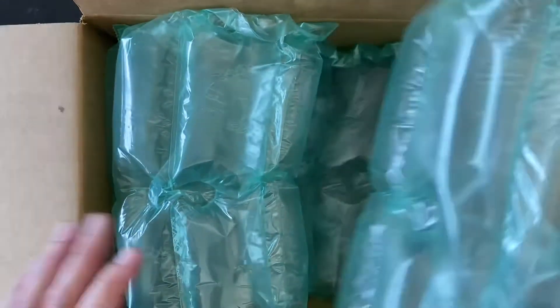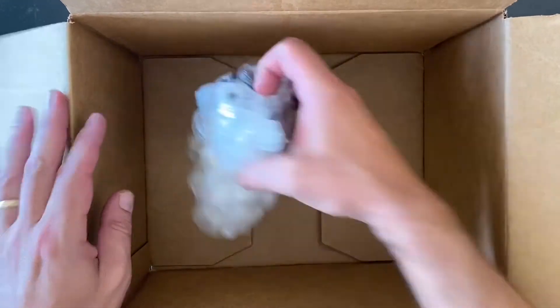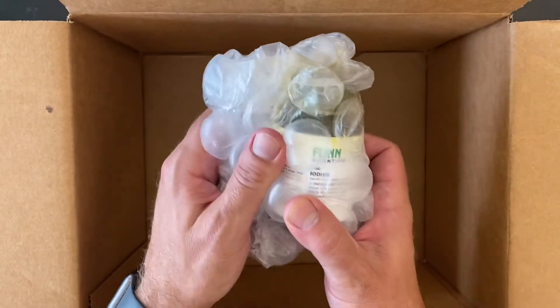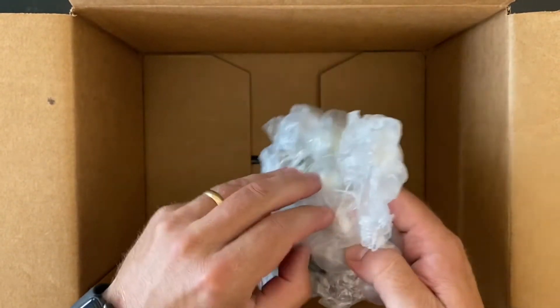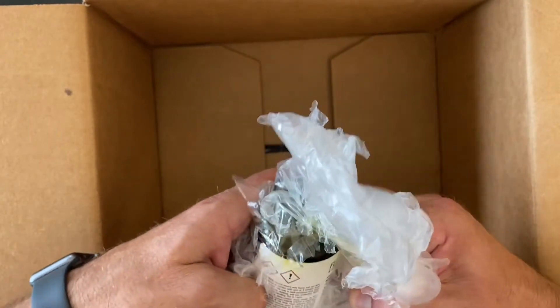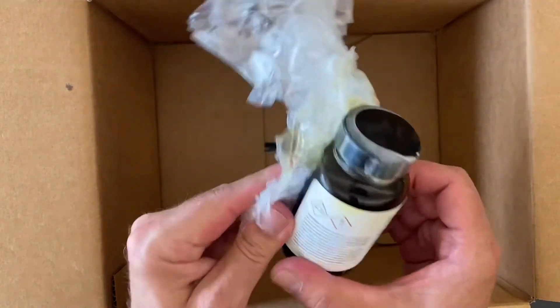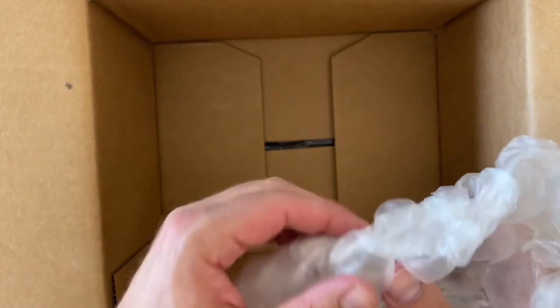One more smaller box with the diamond on the side — and look, this entire box contains one small bottle of iodine. There's a little bit of staining going on because iodine is kind of volatile and the iodine vapor does tend to stain things. We ran out of iodine a little bit last year, so here we go with some fresh iodine.